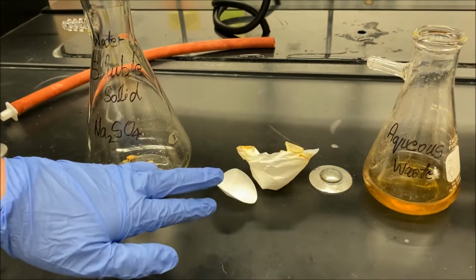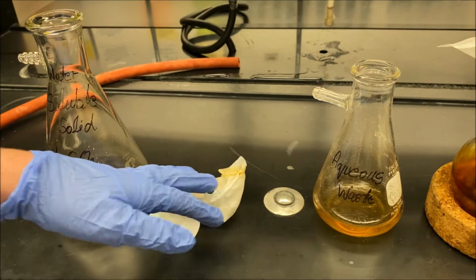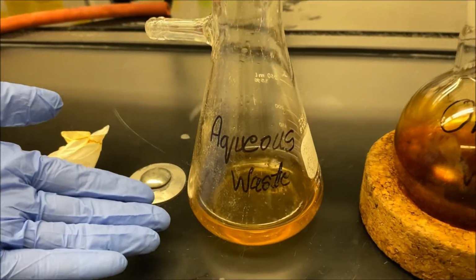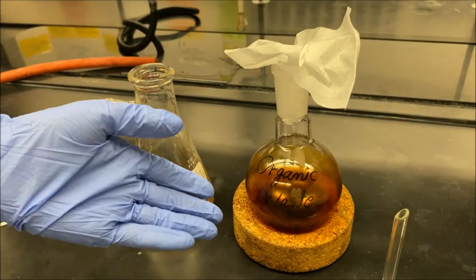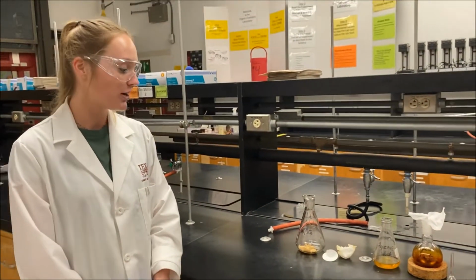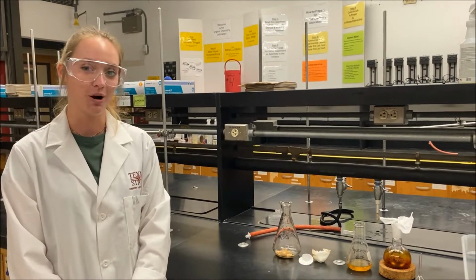And then we've got some solid waste right here. So this is a filter paper and this is a Chem wipe. Right here we've got aqueous waste, which is something dissolved in water, so that'll just go straight in the aqueous waste. And then we've got an organic waste product right here, which will go in the organic waste, and this paper would go in the solid waste. So it's very important to know what's in each of your containers at what time so you know how to dispose of them properly.